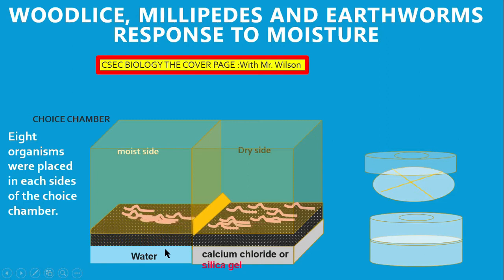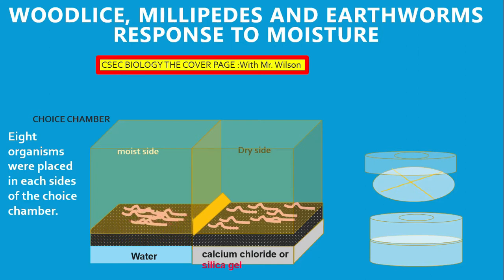For this experiment we're using the earthworm, but the response of the earthworm is going to be similar to that of the wood lice and the millipede. We started the experiment with about eight earthworms — you could count and you might find nine — so make sure that you are doing the counting so that your observation is accurate.